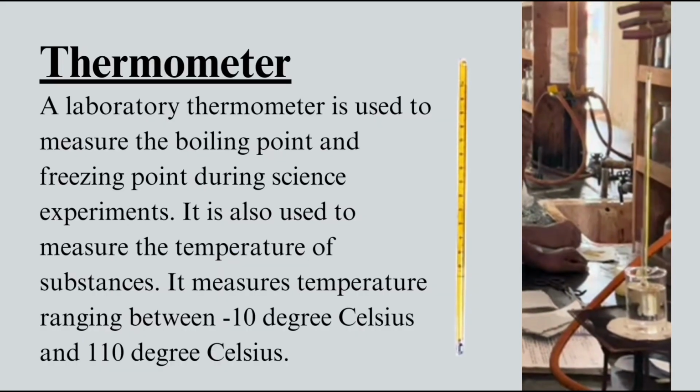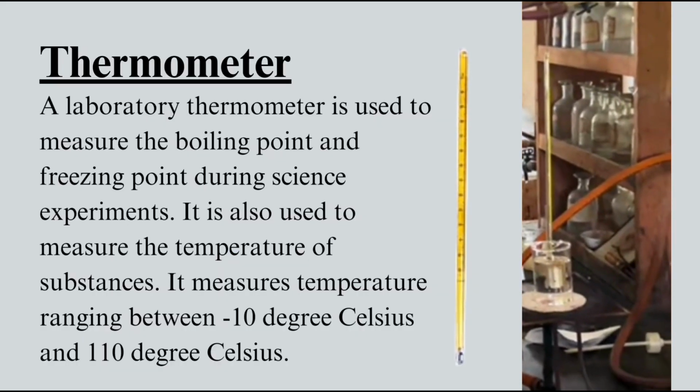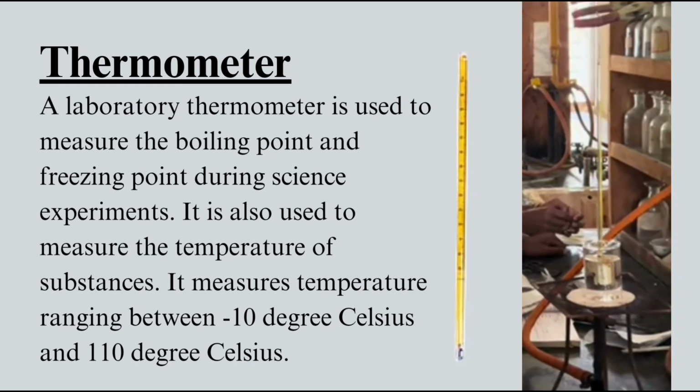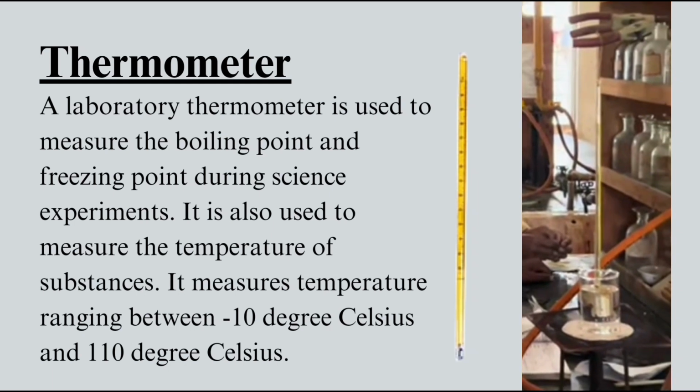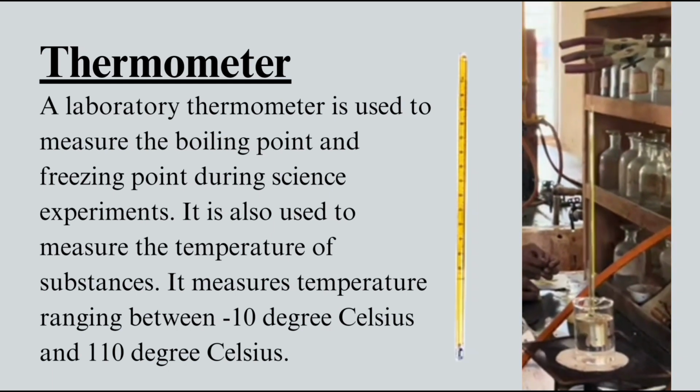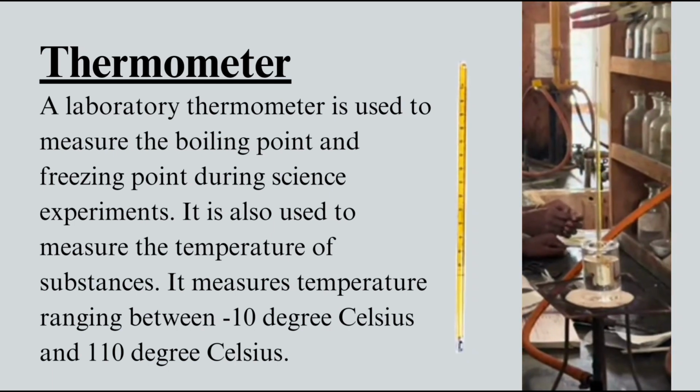Thermometer. A laboratory thermometer is used to measure the boiling point and freezing point during science experiments. It is also used to measure the temperature of substances. It measures temperature ranging between -10 degrees Celsius and 110 degrees Celsius.